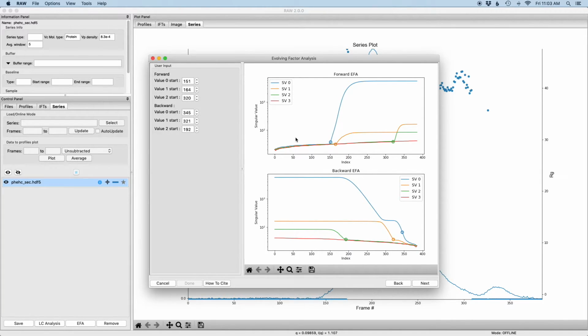And then you take the first two scattering profiles and do SVD, and then the first three and do SVD, the first four and do SVD, and so on until you've done it on the entire range of the data set. And so what happens is, at some point we have a bunch of singular values that are constant, nothing's changing, and then when the first component in the data set starts eluting, we have one of the singular values that starts getting stronger, rising up above the baseline.